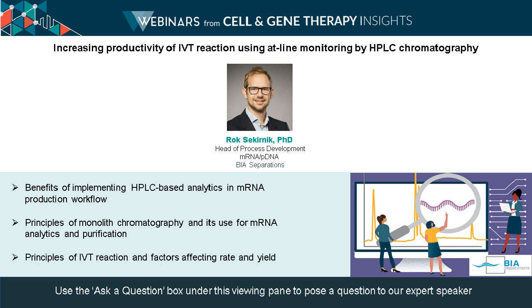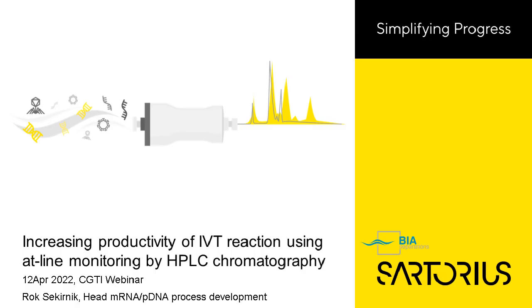Thank you. Thanks very much for this nice introduction, and welcome everybody to this webinar. I hope my pointer is working, and so I can take you through the presentation, which will span the topic as announced. So at the core of it will be the question of how to increase the productivity of IVT reaction using HPLC tools, which I'll describe in detail.